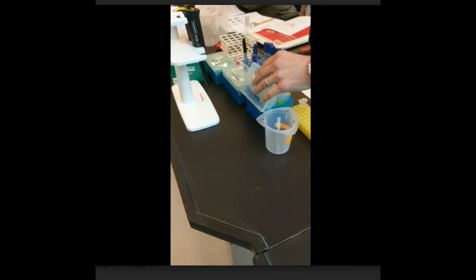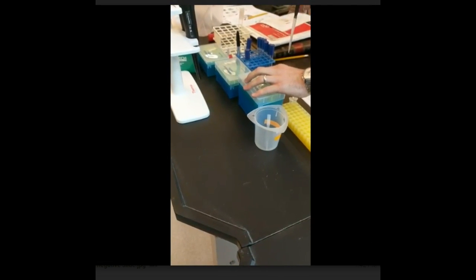Add 10 microliters of your phage stock to tube 1. Mix thoroughly but gently, and then change the tip. Remove 10 microliters from tube 1 and place it in tube 2. Mix gently and change the tip. Remove 10 microliters from tube 2 and place it in tube 3. Mix gently, change the tip.